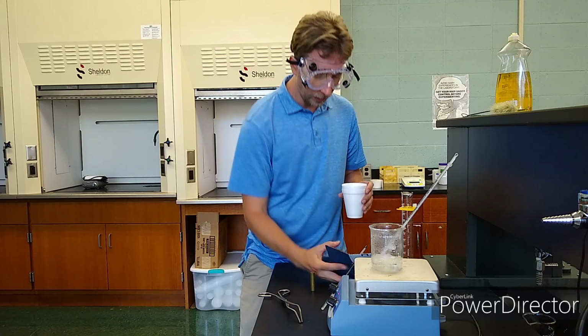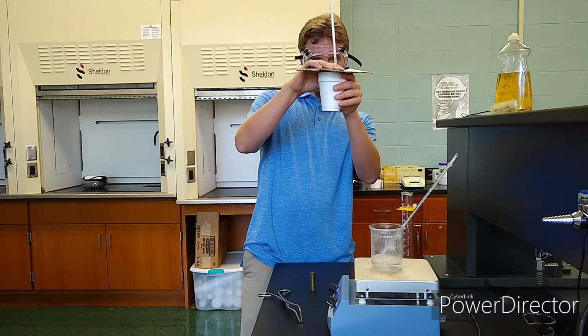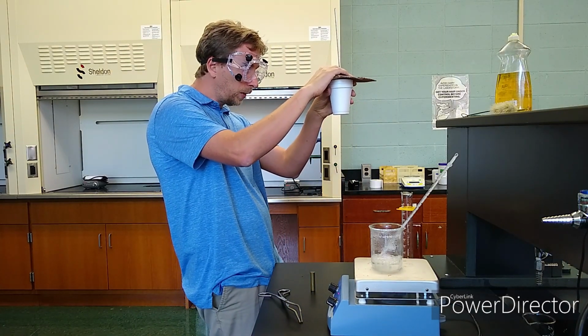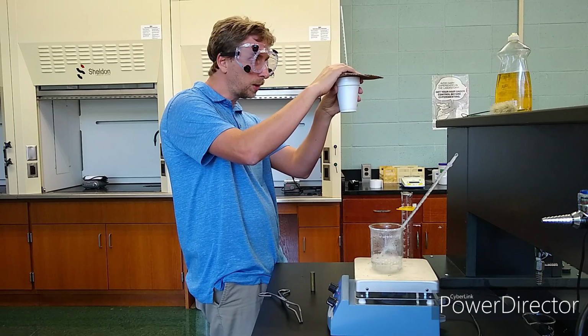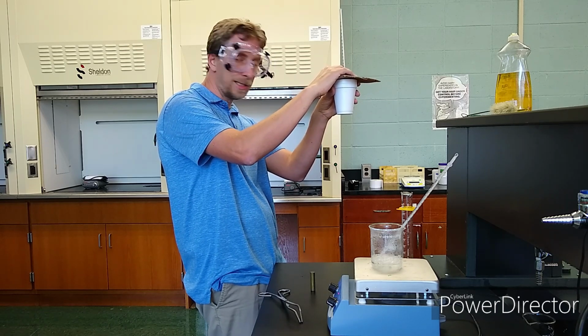Here we go, transferring it. Boom. Put the lid on there real quick, and swirl. All right, see, that was the critical part. And going up, it's up to 25 degrees Celsius now. Swirling, swirling. It's up to 26 degrees Celsius now.